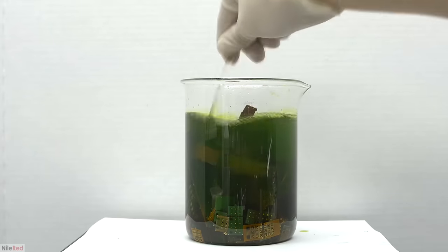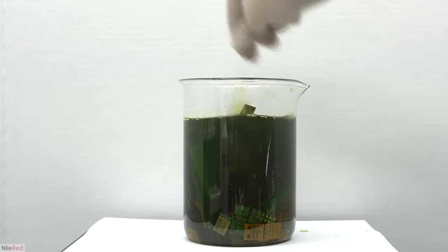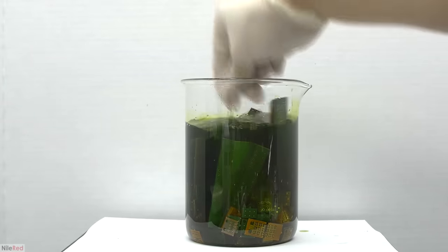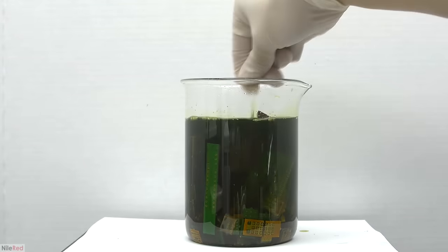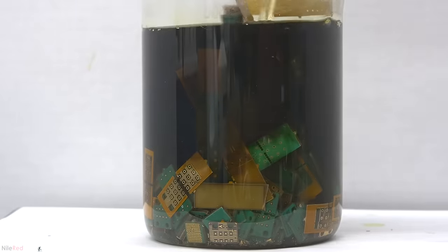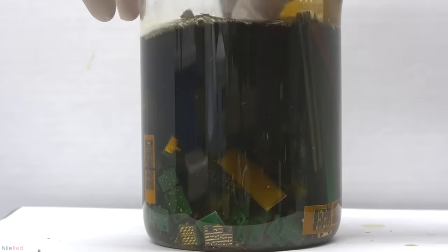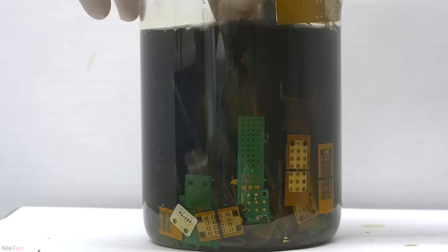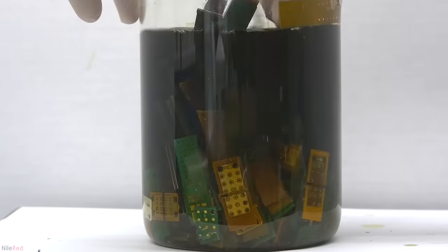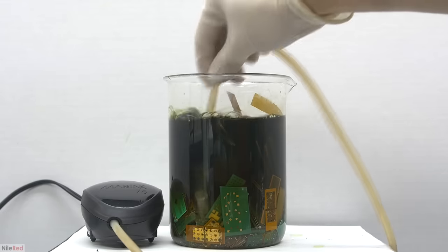Most boards have a base layer of copper, which then has nickel plated on top, and then gold plated on top of the nickel. Muriatic acid alone is not a strong enough oxidizer to react with either the nickel or the copper, which is why we had to add the peroxide. In the presence of an oxidizer like hydrogen peroxide or oxygen gas, the reaction occurs and we can dissolve both the copper and the nickel. Even with hydrogen peroxide, the reaction is still pretty slow, so the general procedure is to leave things for a week with occasional stirring. Even though it's only been about two hours, when we stir things around we can already see that some gold has been separated from the boards. To add more oxygen and keep things agitated, we can use an aquarium air bubbler.